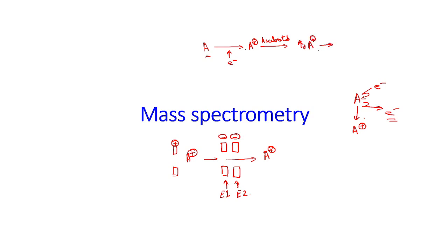Then this enters into the analyzer section, okay. Now this analyzer section is having a magnetic field. Suppose you are getting this analyzer section.